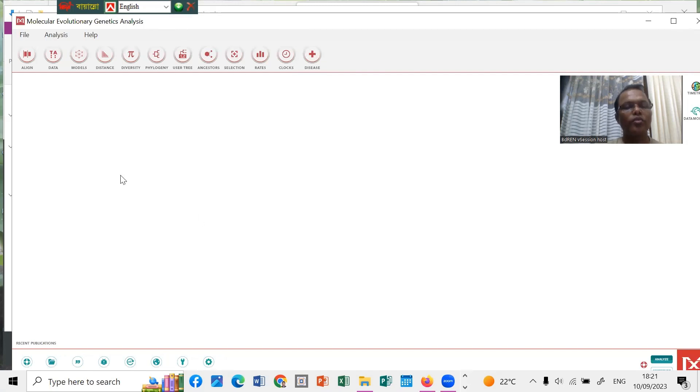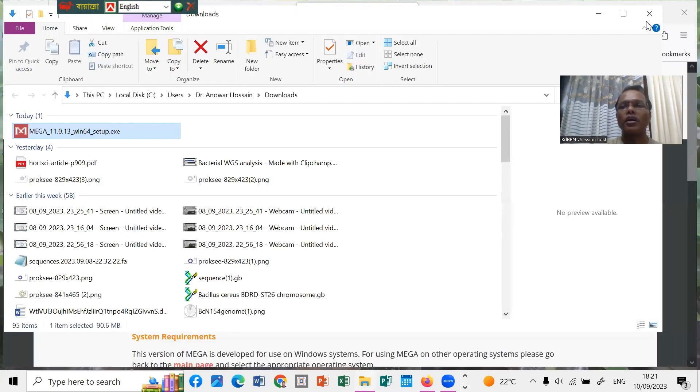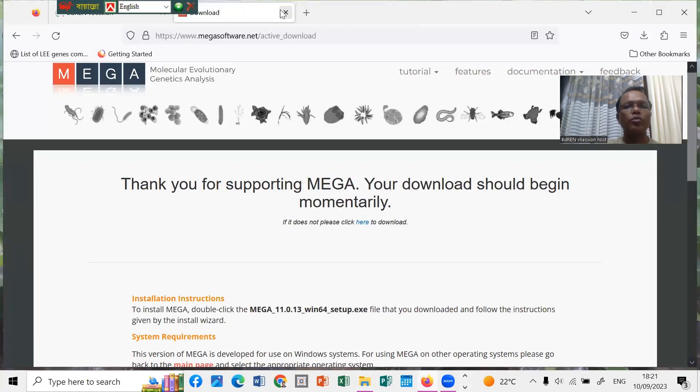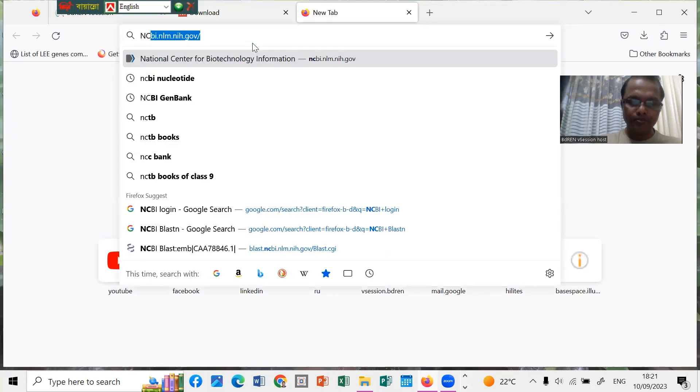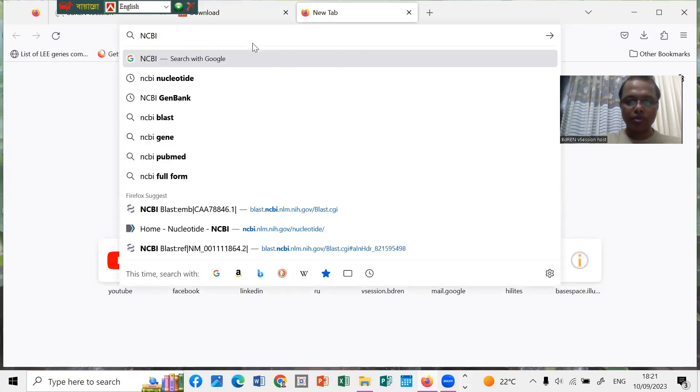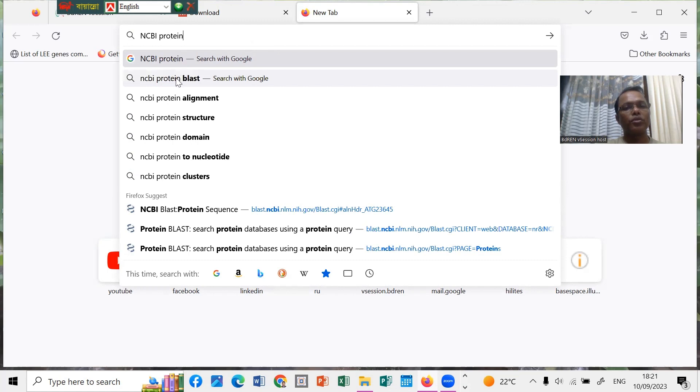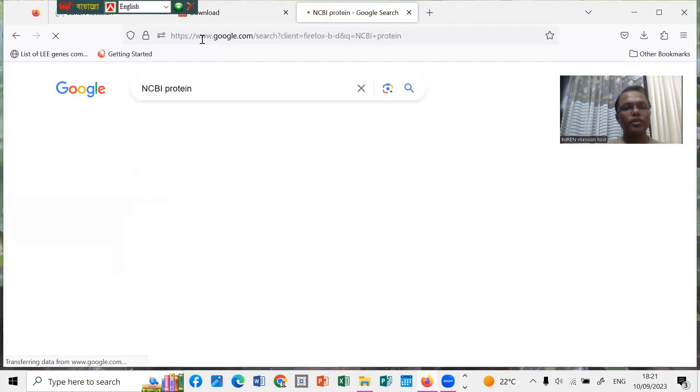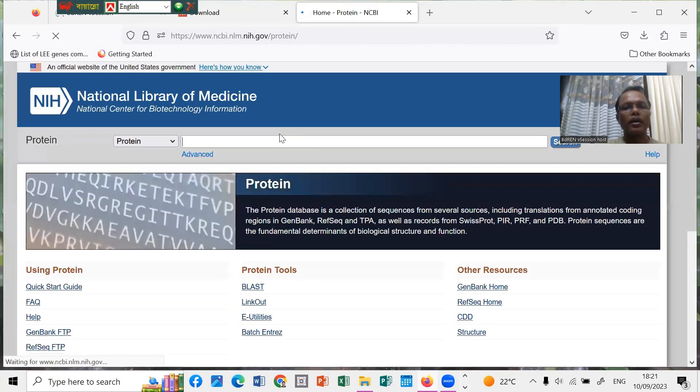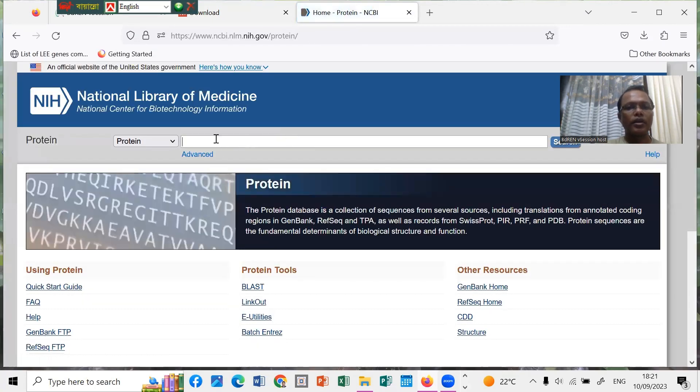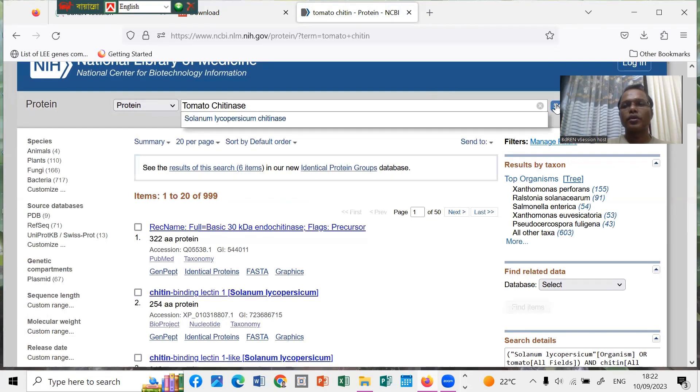Before starting our analysis, the construction of phylogenetic tree, we have to download some sequences. For example, we have to go to Google and search for NCBI protein sequence. You can take protein or nucleotide sequence, no problem. I take the protein. I can write tomato chitinase.